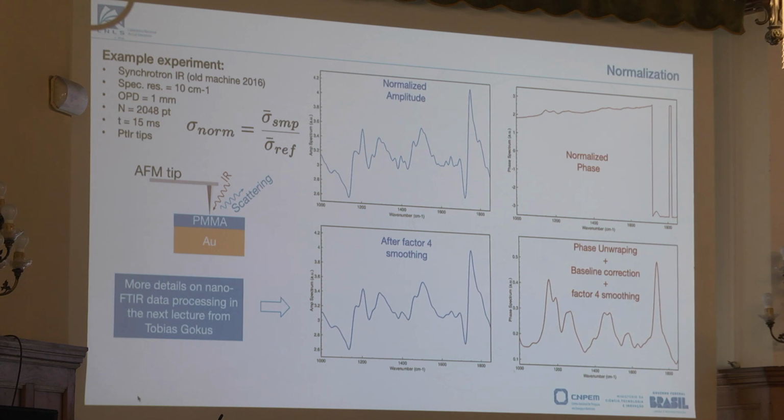So there is not much magic here. You really need to divide those signals and then do some post-processing. Still simple. The only step that actually changes the data here is the smoothing, and this should be done with care, right? You never want to kill a peak or introduce extra peaks, right?